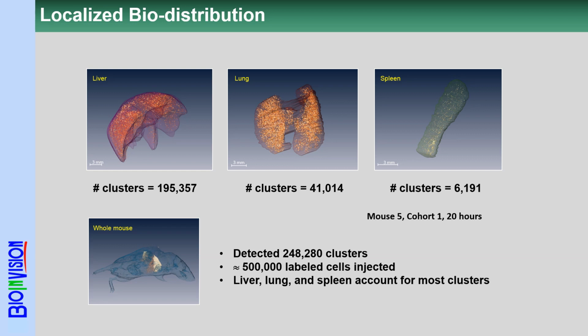But importantly, CryoViz is not just about pretty pictures. When we are dealing with scientific investigation, quantification is important as well. Here you can see the power of very large data collection and modeling expressed in meaningful biodistributions.